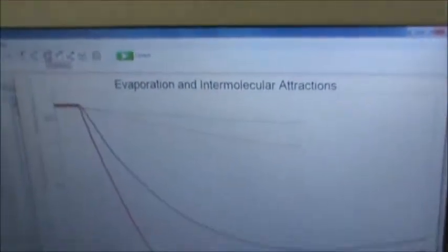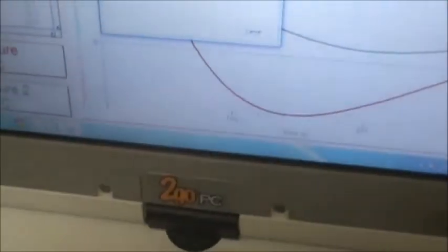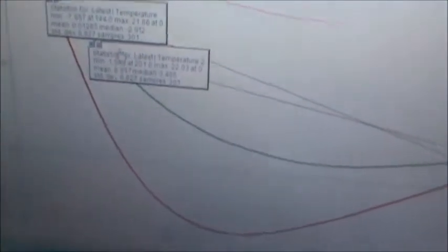So all you got to do next is to record your information. I'm going to hit the stats button. It's going to ask me which ones I want. I want the latest ones on this window. I click OK, and it awkwardly puts these boxes in a weird spot, so I can't really see them clearly. You can see that they're kind of crossed over, so fix that.